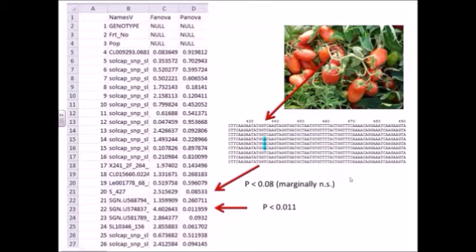And so here's an example of that file, and I can kind of search through it, and I can find an example of markers that fall below the 0.05 cutoff and are potentially linked to genes that affect the number of fruit that I get per plant. In some cases, these SNPs may actually be in candidate genes for like the branching of the inflorescence.